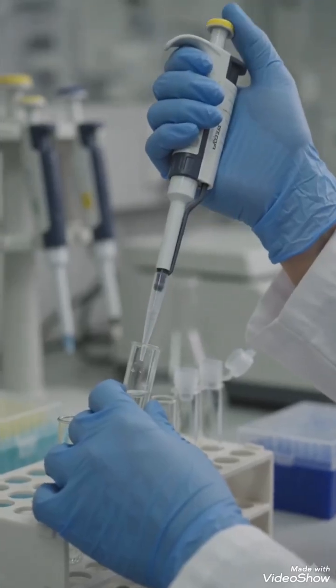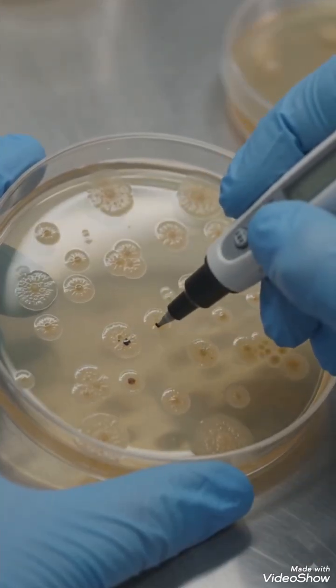Welcome to the Microbiology Laboratory. In food, water, and pharmaceutical microbiology and clinical laboratories, it is important to determine the number of microorganisms. This process is known as enumeration of microorganisms. Enumeration helps us determine microbial quality, contamination level, safety of food and water, effectiveness of sterilization.